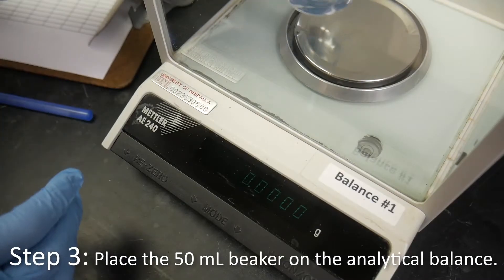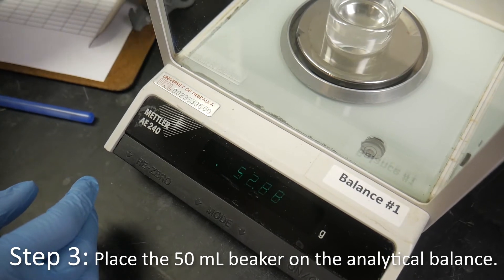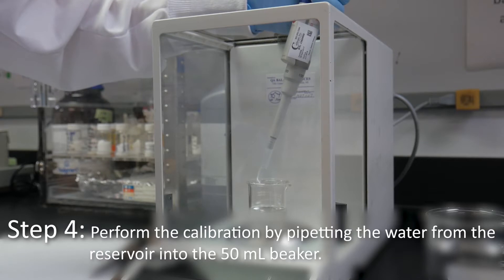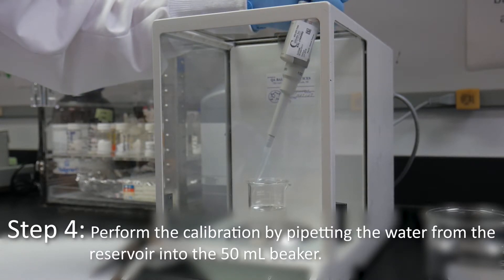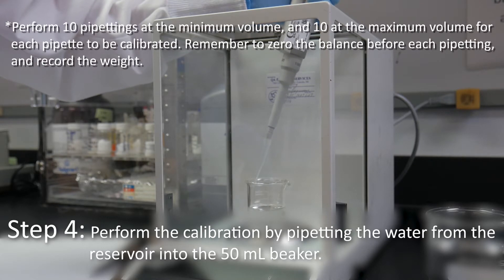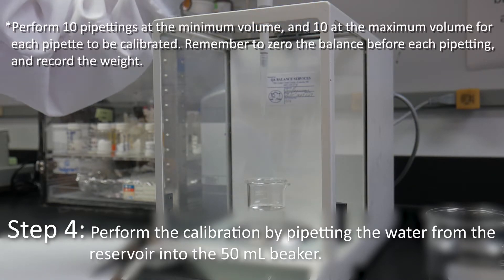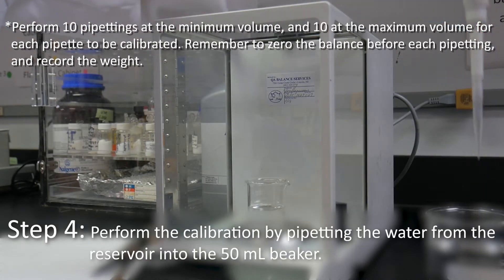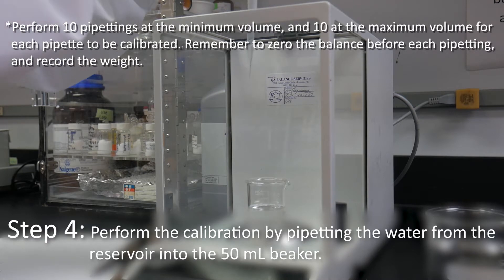Place the 50 milliliter beaker on the analytical balance. Perform the calibration by pipetting the water from the reservoir into the 50 milliliter beaker. Perform 10 pipettings at the minimum volume and 10 at the maximum volume for each pipette to be calibrated. Remember to zero the balance before each pipetting and to record the weight.